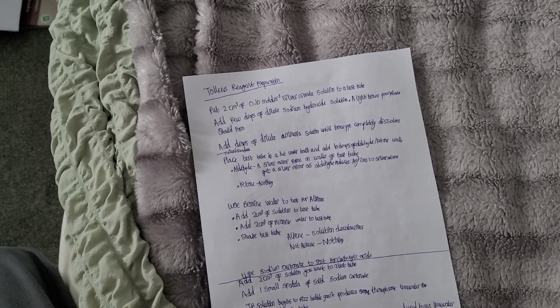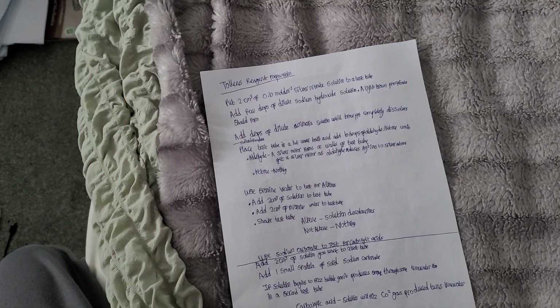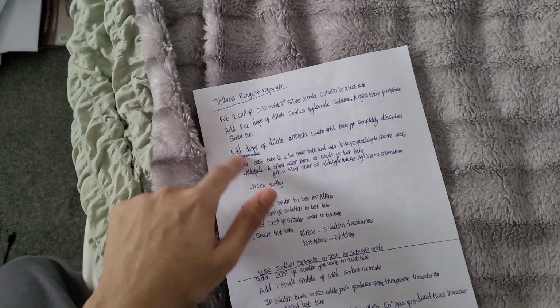Then add drops of dilute ammonia solution until the brown precipitate that originally formed from the dilute sodium hydroxide completely dissolves. And this is Tollens reagent. That's how to make it.